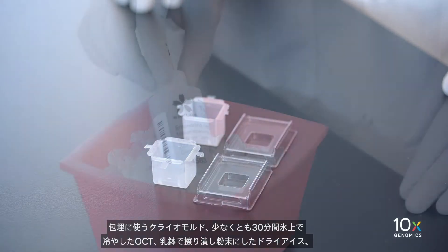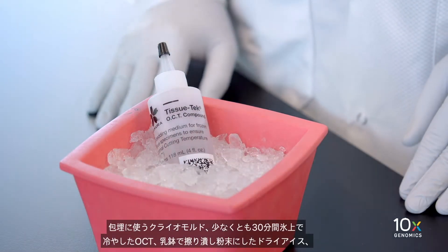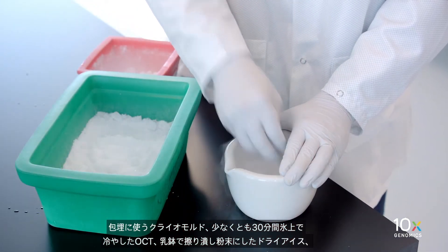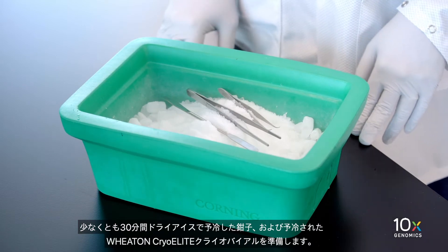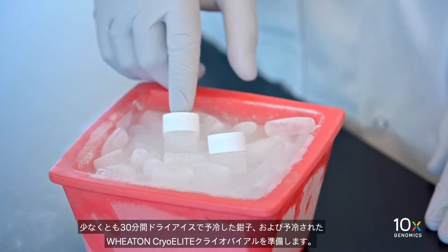We are ready to OCT embed our frozen tissue. We have a cryo mold for embedding, chilled OCT that has been on ice for at least 30 minutes, powdered dry ice that we've made with a mortar and pestle, specimen forceps that have been pre-cooled on dry ice for at least 30 minutes, and a pre-cooled Wheaton CryoELITE cryovial.